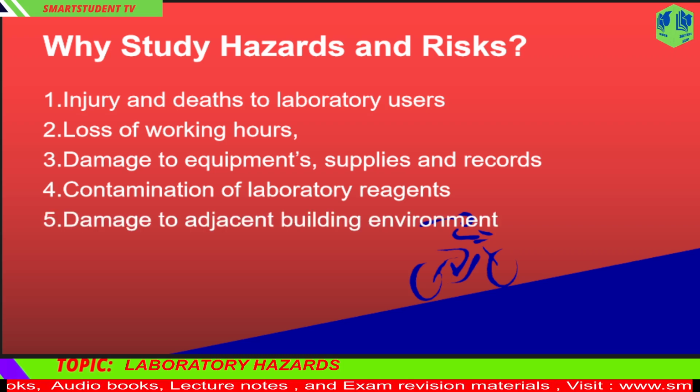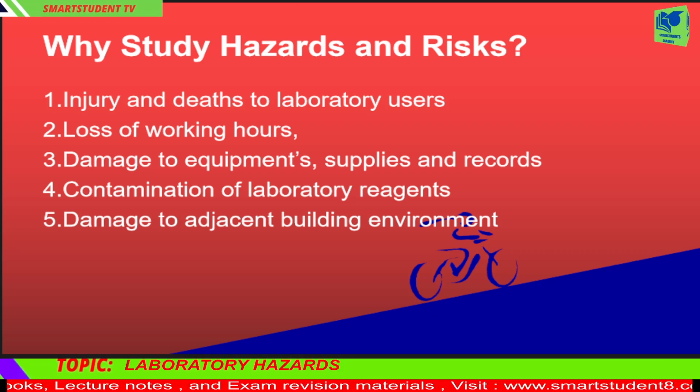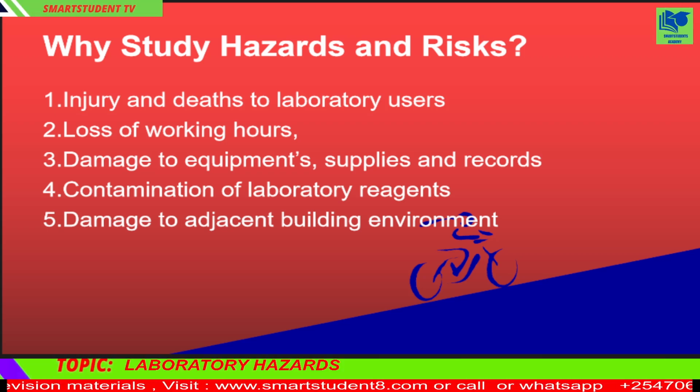Laboratory safety is concerned with all safe practices in the laboratory. Failure to observe laboratory safety practices will result in risks and eventually accidents. A good laboratory management is one that always strives to minimize chances of risks in the laboratory environment.